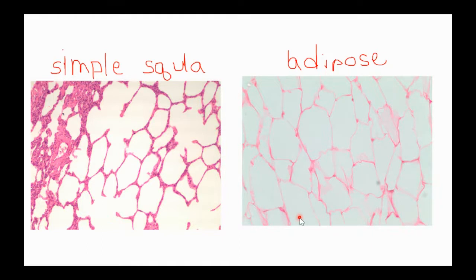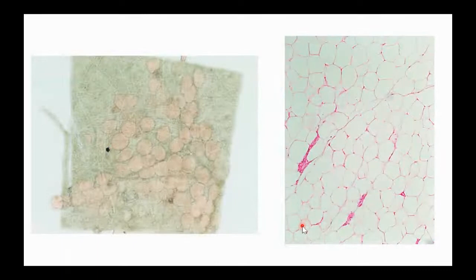This is one of the ways that my adipose tissue slides will look. The other way that they will look is what we see over here. This view of adipose tissue, notice how my cells are orange. So I'm seeing these orange adipocytes. What's cool about this particular adipose tissue slide is that we didn't actually wash away the lipids that are inside these cells. So that's the orange that you're seeing here. We actually dyed the lipids inside of the cells orange so you could see them.